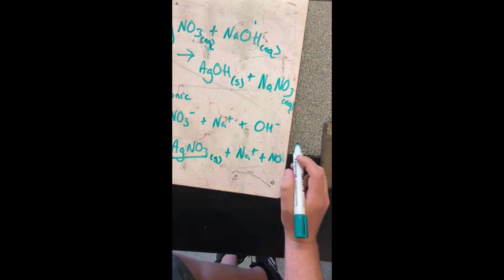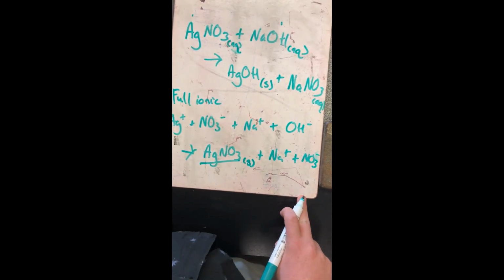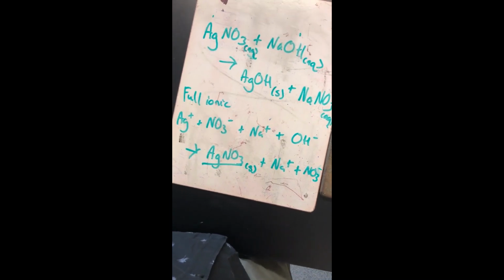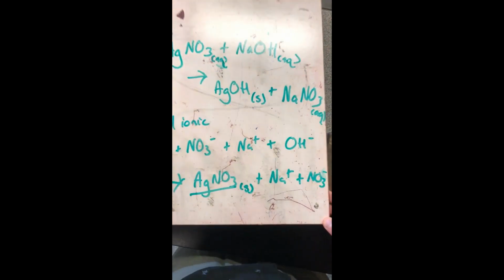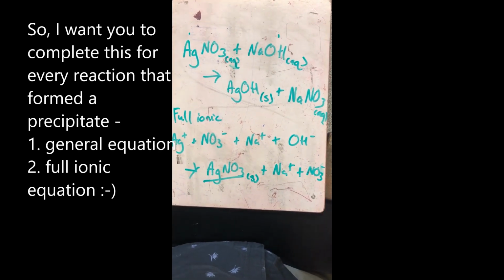That's how we get that, all right? So can we see how we get to those equations? I just realized I missed the silver, but you can clearly see there that Ag is the silver. Have I still got this zoomed in? No, I don't. It's just a big board. But as you can see, this is how we got the reaction.